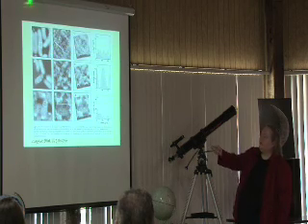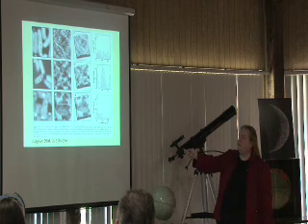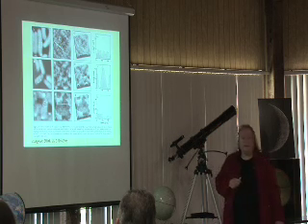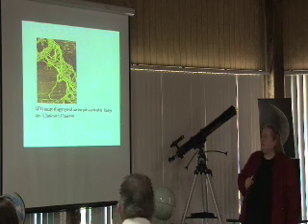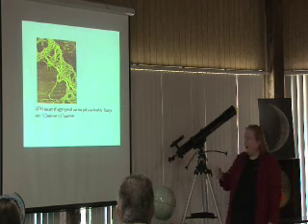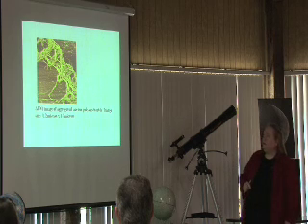And so you look at the big view, you see the shape of the rods. These are the bacteria. These are the bugs, and this is the surface of one, like the square area. You zoom in on that square area, you can see the fine details of those structures. It's a whole new way to study bacteria. These are polysaccharides. This is another biomolecule, and you can see the strands and filaments and see how they are arranged on the surface.